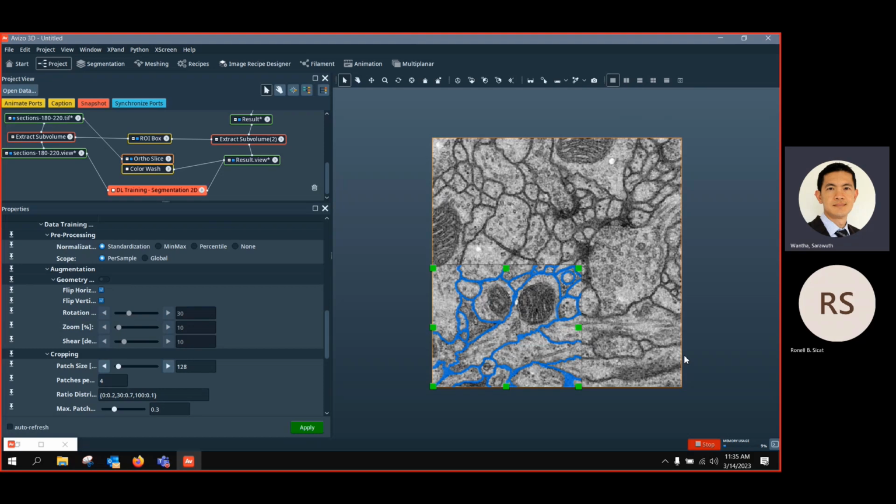So you could be suspicious about how the model is going to predict if you have an image with mitochondria on the right or bottom. Maybe the model will learn this pattern by heart and not understand the global feature of the structure. So you have to give it some other option, and this is where augmentation comes into play. When you check it, it can replicate or duplicate or create fake images. For example, you can flip them horizontally, flip them vertically, rotate, or even shear.